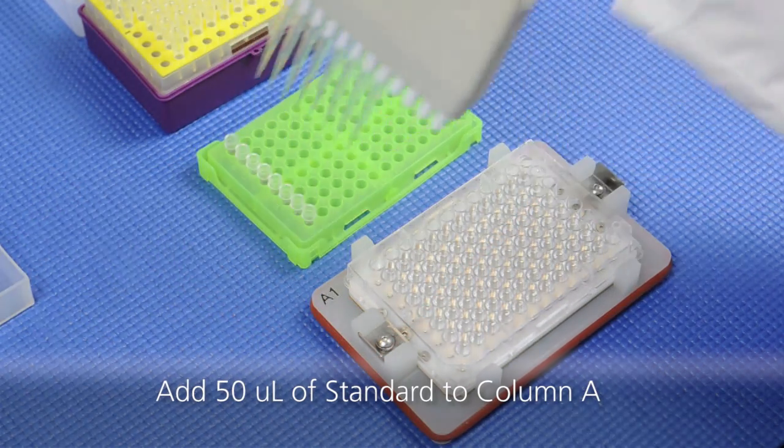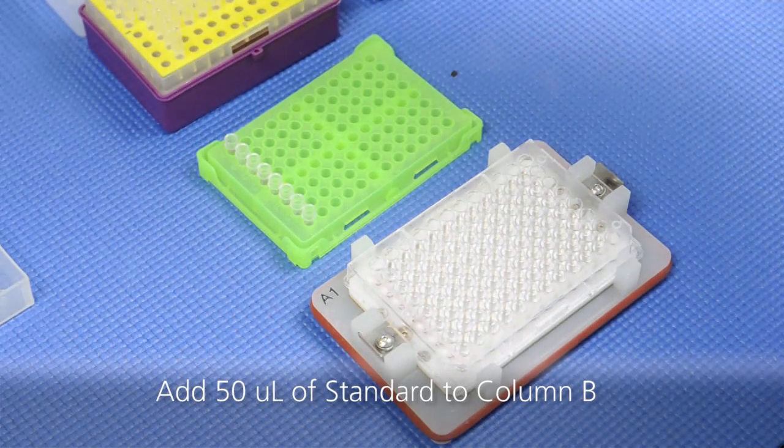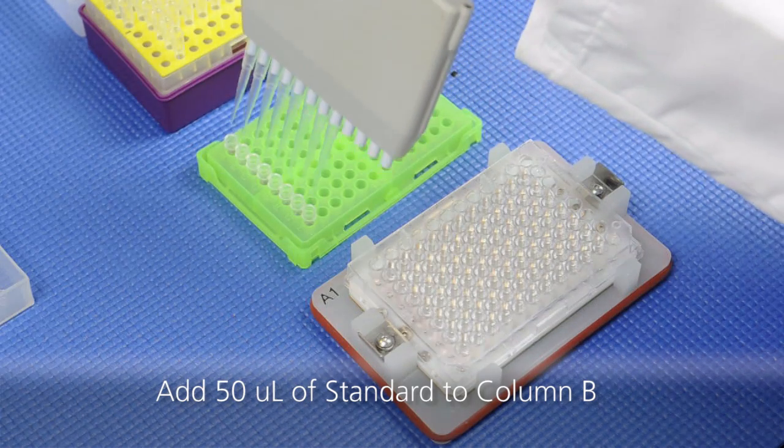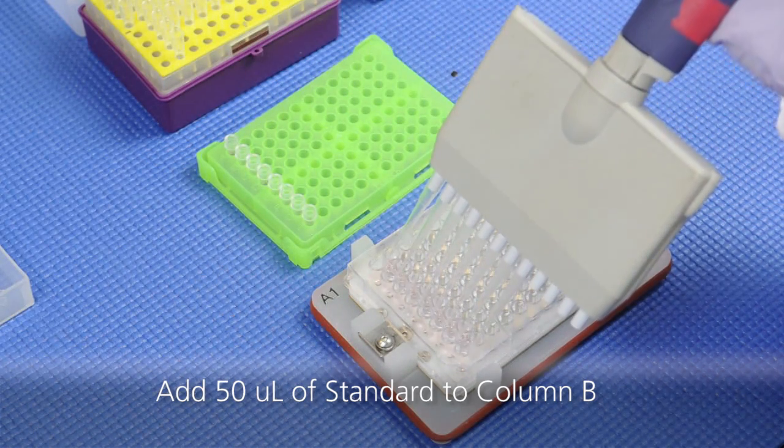Transfer 50 microliters of the standard using a multi-channel pipet into column A. Using new tips, transfer 50 microliters of the standards into column B of the microtiter plate.